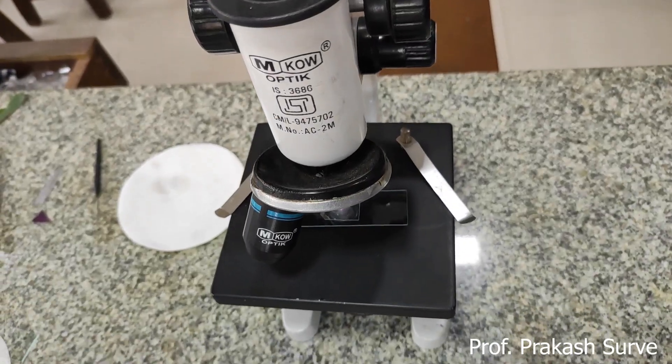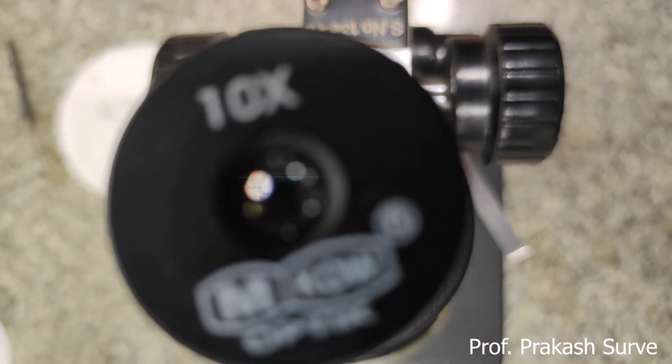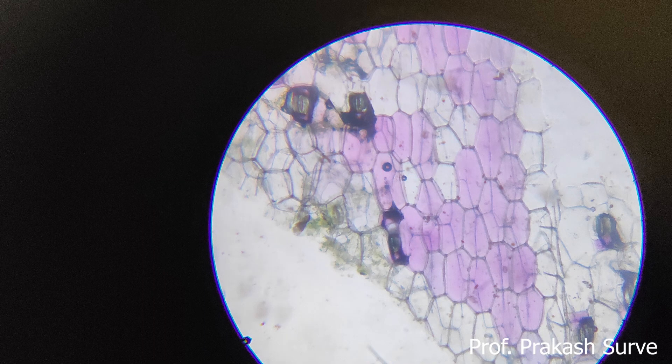We watch through the 10x eyepiece on the lower side with the 10x objective. This is what we are getting — this is the lower epidermis where all cells are full of protoplasm. The colored sap is present — these are normal cells full of pink colored protoplasm. That's why we have taken the lower epidermal cells. Maximum cells show a colored sap, which is why the lower surface of the leaf is pink in color.